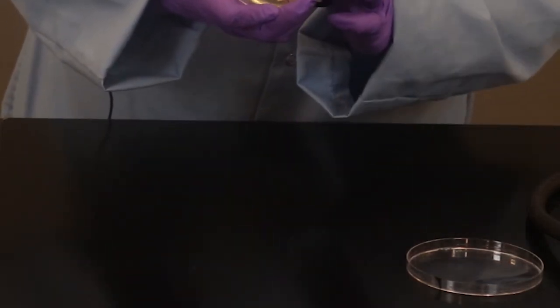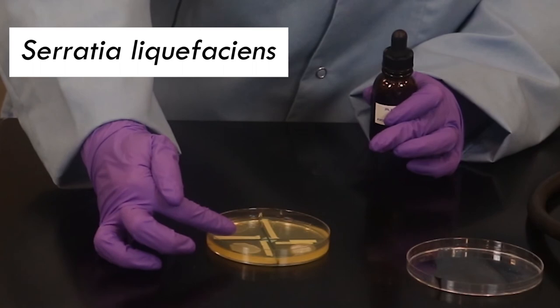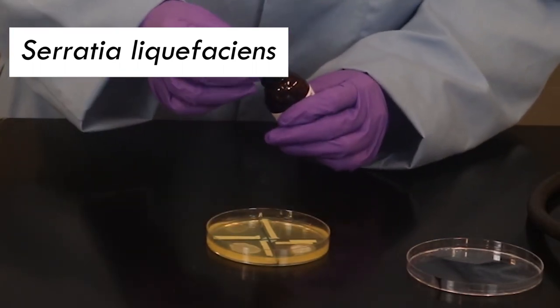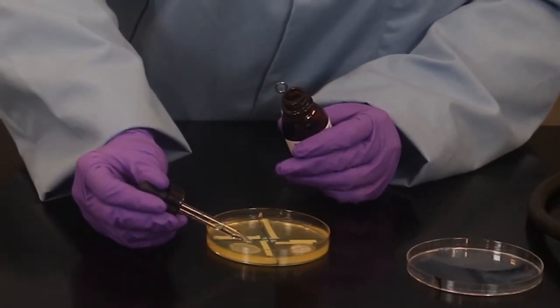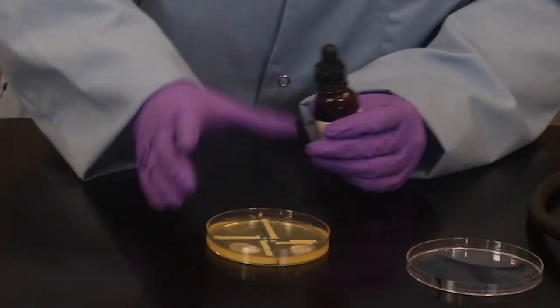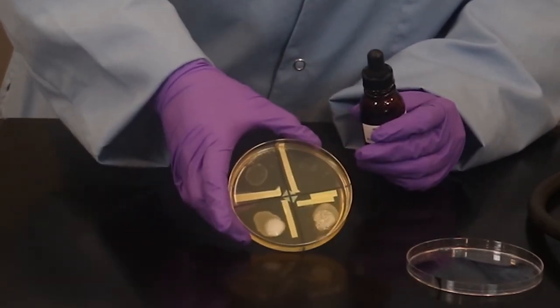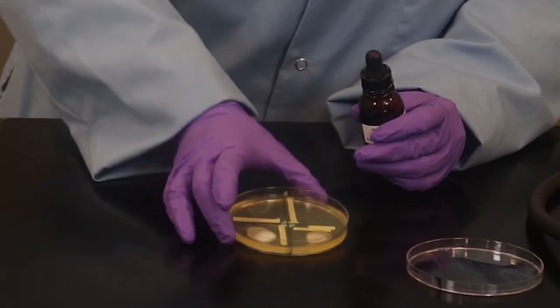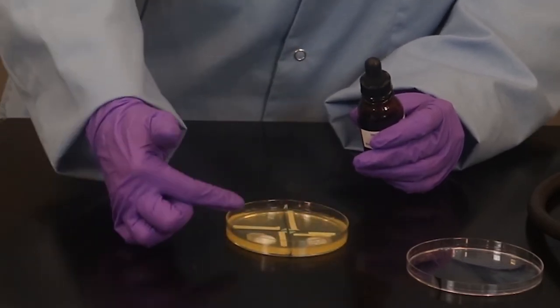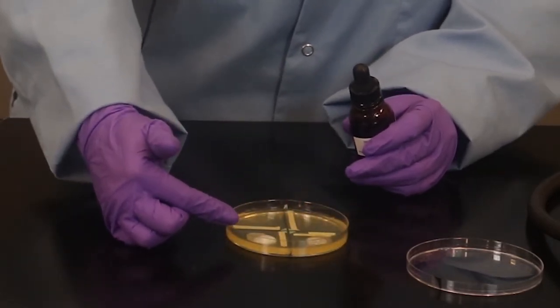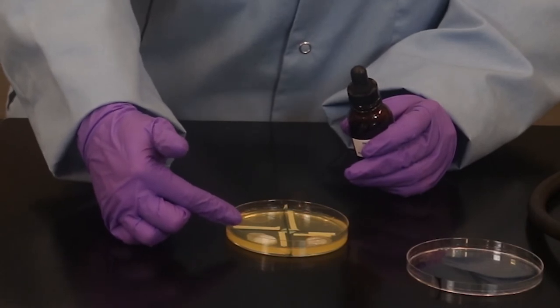The next one over here, Serratia liquefaciens is pointing here. Repeat. We're also getting a very decent reaction for catalase. Makes pretty good sense in the aerobic condition, and it also has the catalase enzyme.